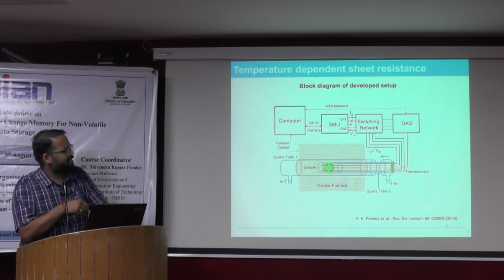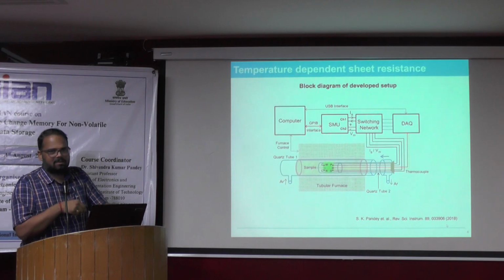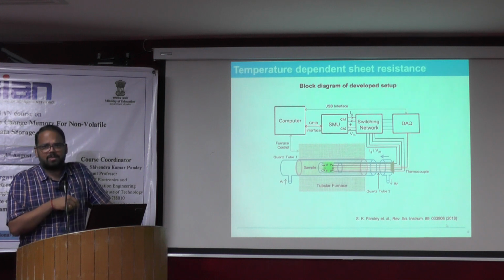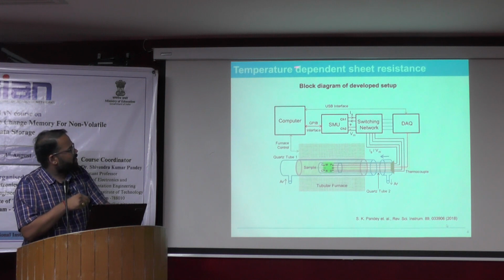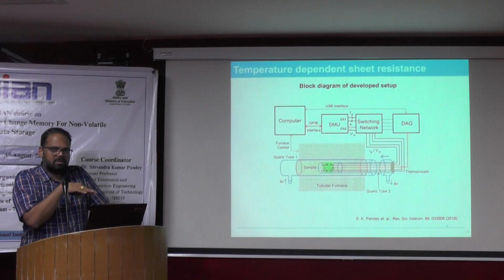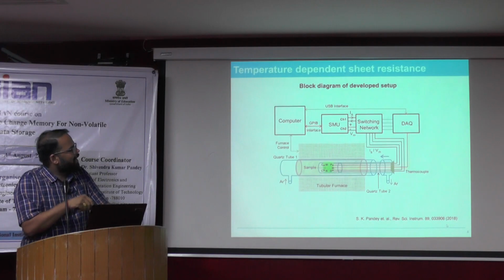So this is the electrical setup basically, and along with that you have a switching network. The switching network has a special purpose for measurement of this thin film. It's a kind of switching; it is switching the terminals.